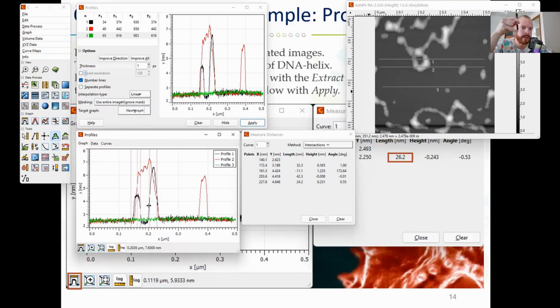It's not dimensionless. It has physical dimensions. And when it approaches the surface, the sample, when you're scanning, first you feel the object with the side of the tip, and then you have the feedback.